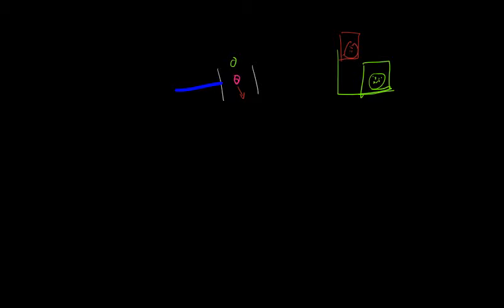The cell moves, and then what we use is called a nozzle. There are two types of stream-in-air sorter: one is cuvette based, and the other is pure stream-in-air sorter. Here I am talking about a cuvette based sorter, where the cells are illuminated in the flow cell cuvette, and as the cell exits the flow cell cuvette, there is something called a nozzle.